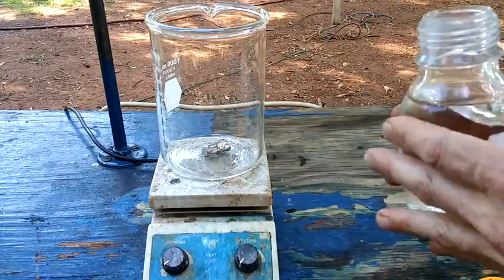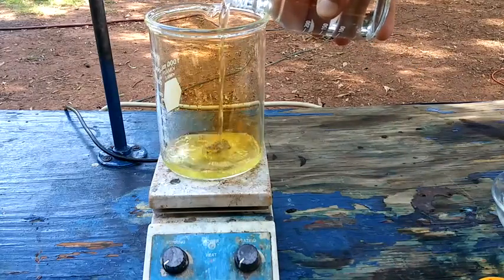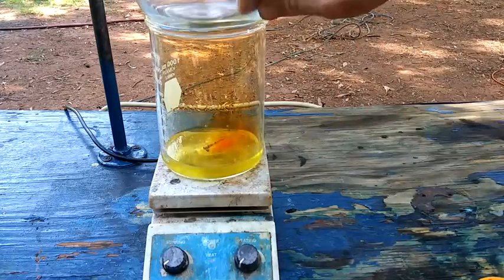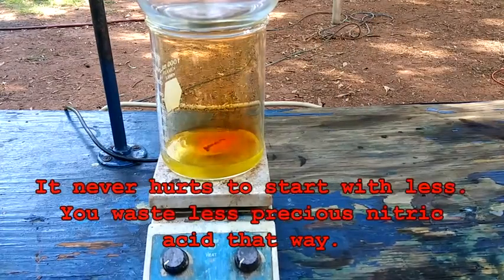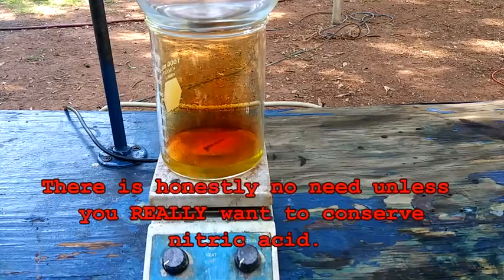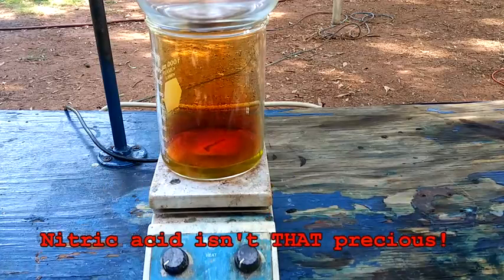Add the 12 molar nitric. And you can see that it's already off to a good start. Actually, I'm not even going to bother covering that completely. Now, obviously, I have not worked out the stoichiometry here. If you wish to, that'd be my guess. If I have a little bit of extra nitric acid left over at the end, I'm not going to stress over that at all. It's really not a big deal.